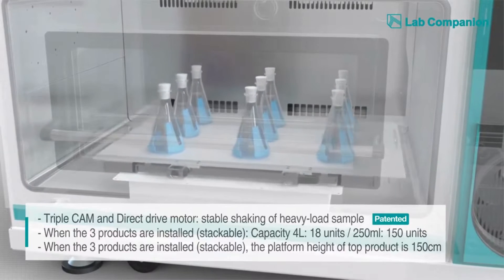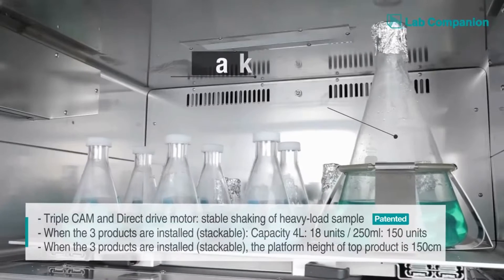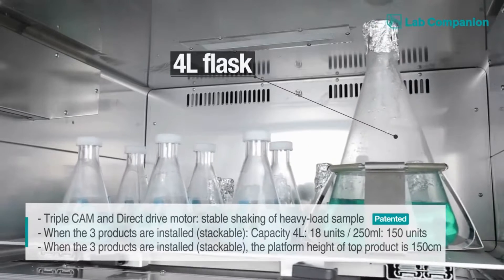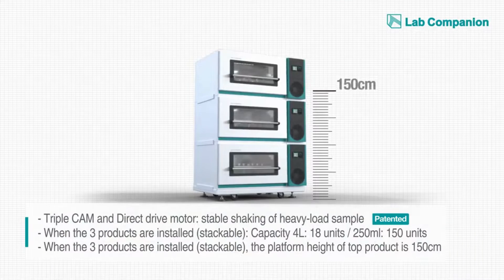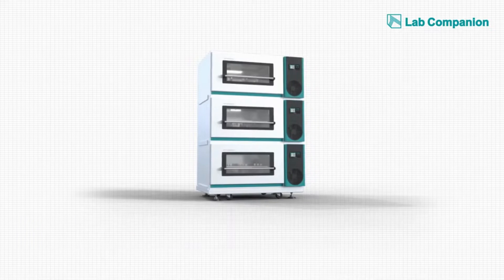In addition, the clever design provides platform height flexibility, allowing the most efficient use of incubation space. When stacking three levels, it can load up to 18 four-liter Erlenmeyer flasks, but the total height would still be just under 150 centimeters, allowing easy physical accessibility to samples.